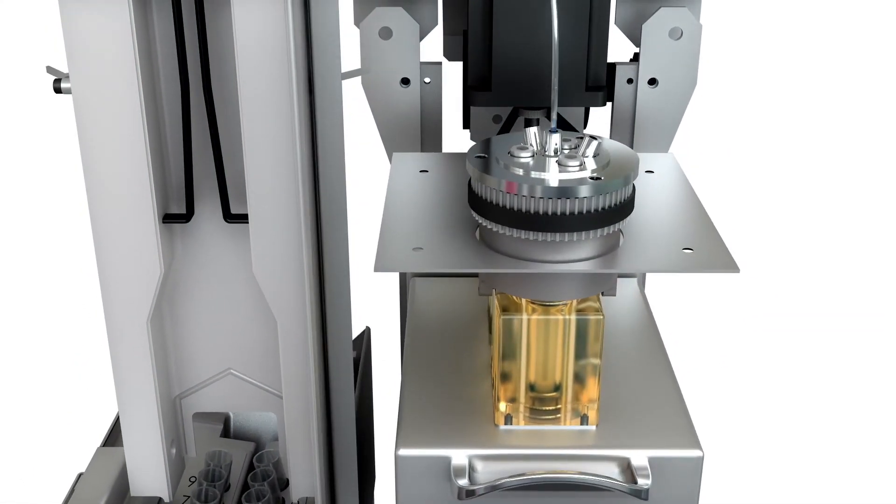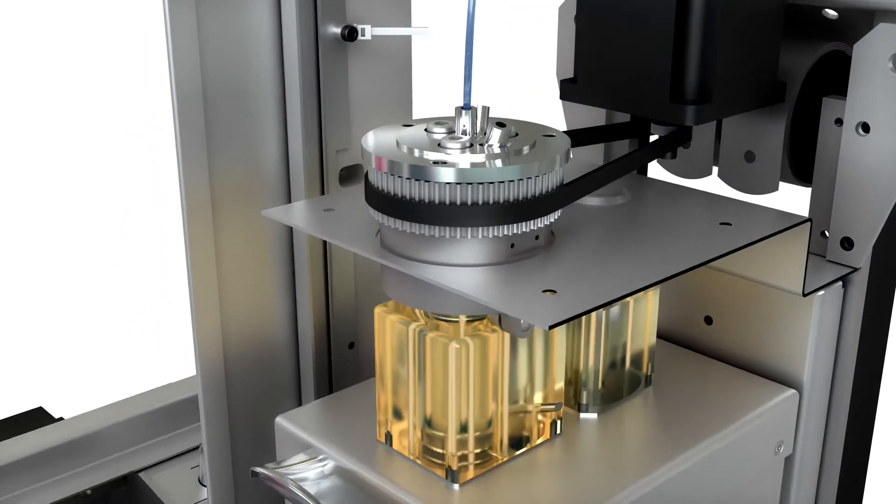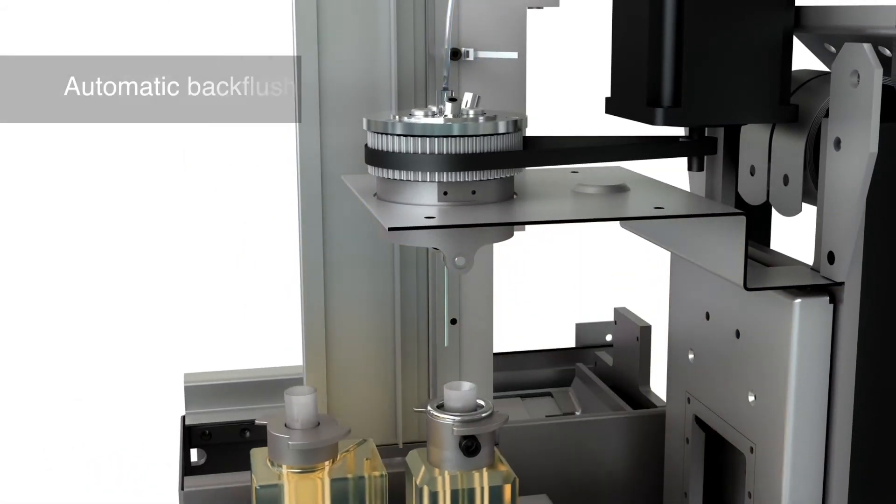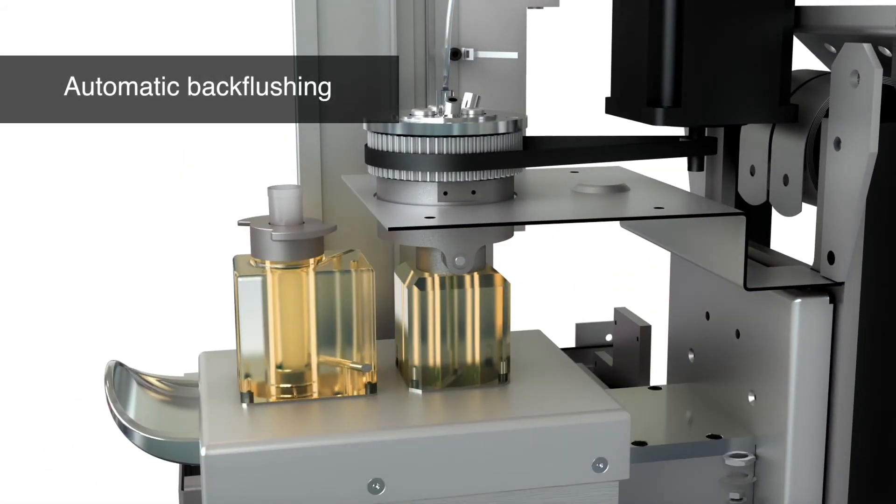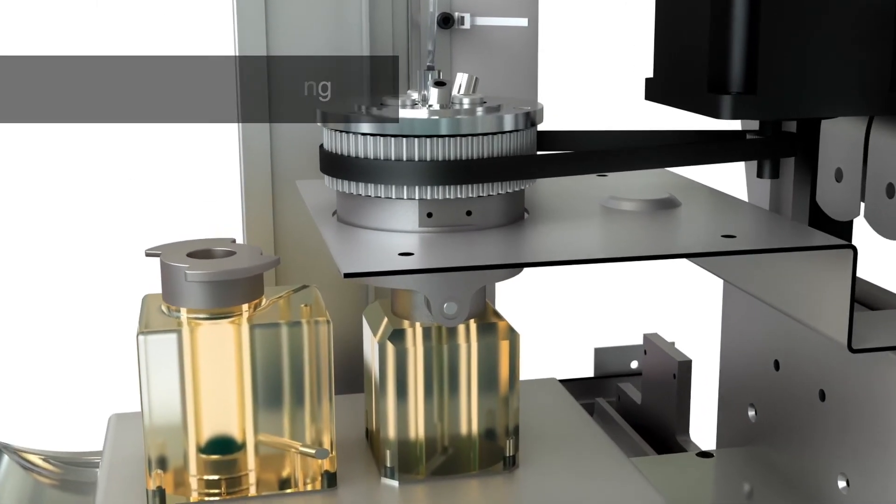The loading stage includes a washing station, where the sample line is cleaned inside and out between runs. Automatic back-flushing of the sample line in the washing station minimizes the risk of cross-contamination.